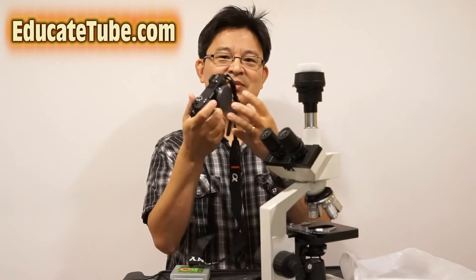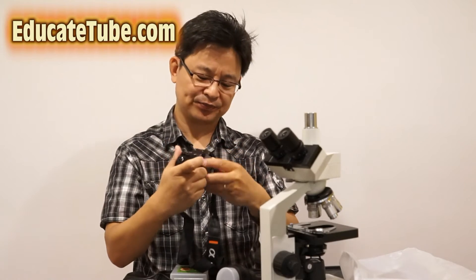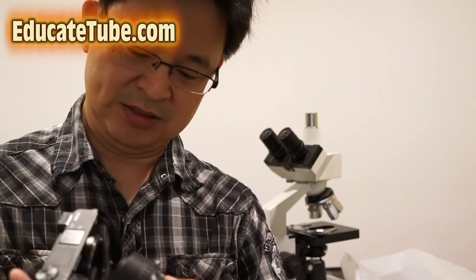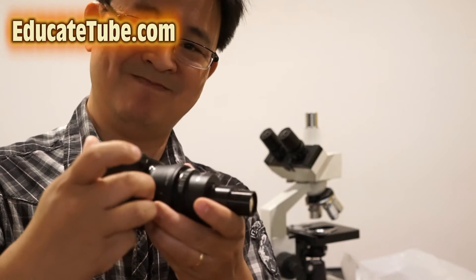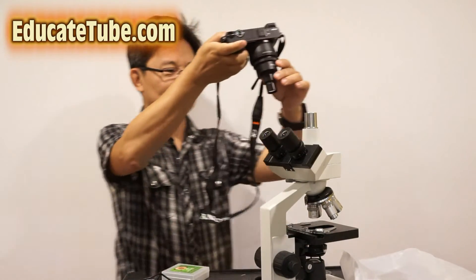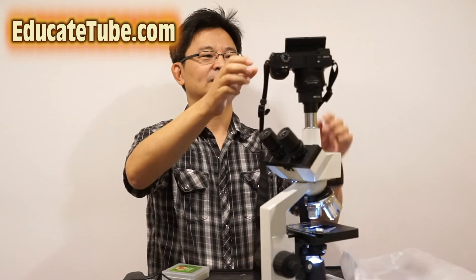So from a Nikon F-lens to E-mount Sony adapter. All I have to do is take the adapter, let me come closer so you can see — line up the red dots to the camera and snap it in. You hear that click? That's in now. You have Nikon to Sony to camera. Then place it onto the tube adapter for the camera, and I'm able to turn on and view what's inside.